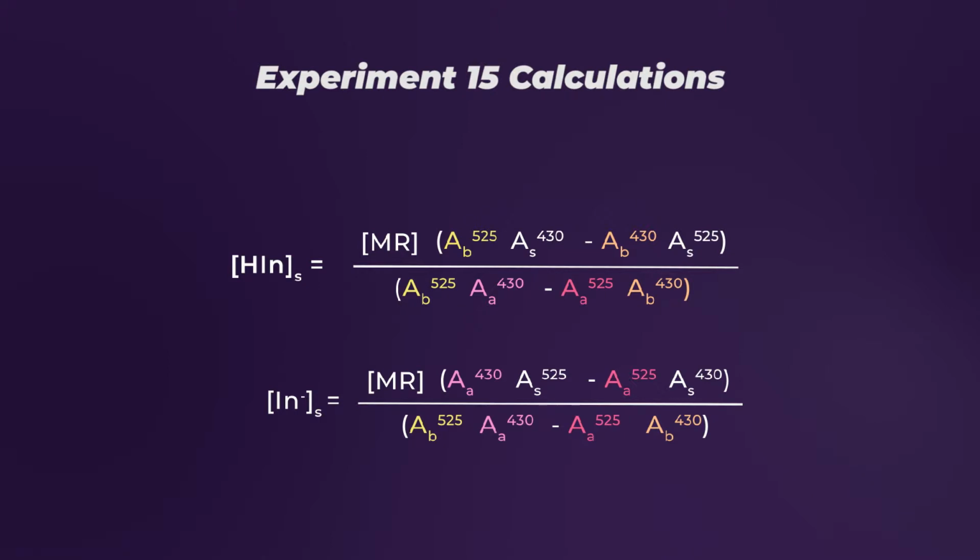Of course, you want to make sure that you're staying consistent. Whenever you're looking at a solution, use those values for that specific solution. So you want to make sure that solution 1 is used for both formulas, and now when you're calculating for the solution 2, you use those values for those two specific formulas.